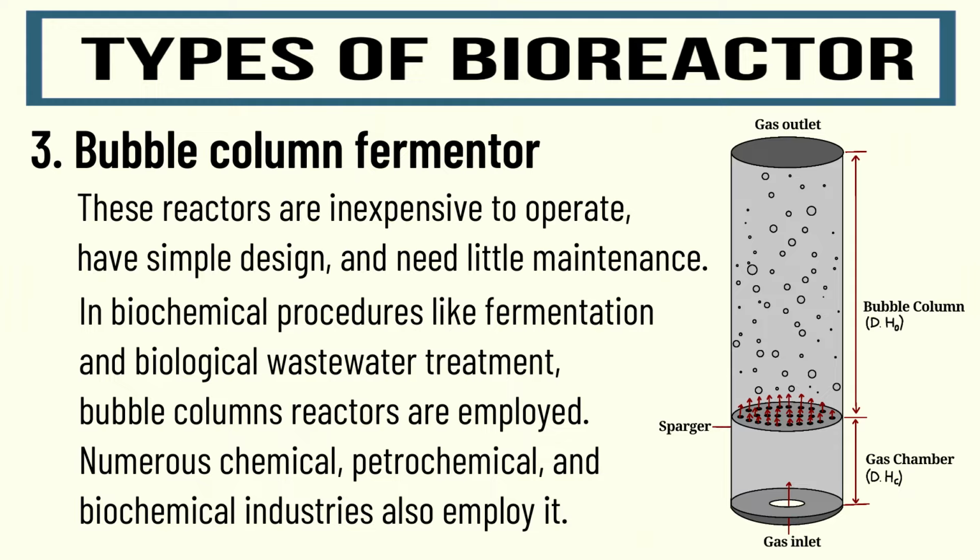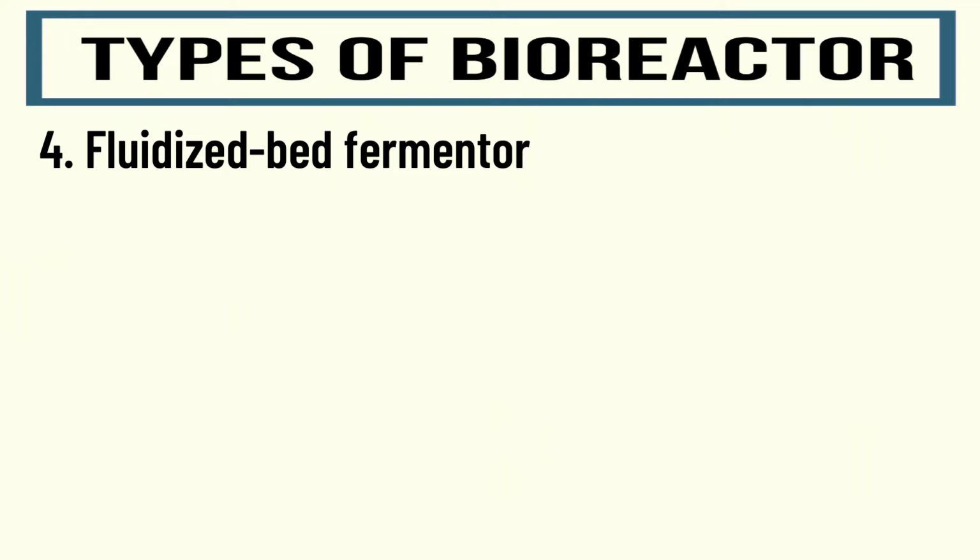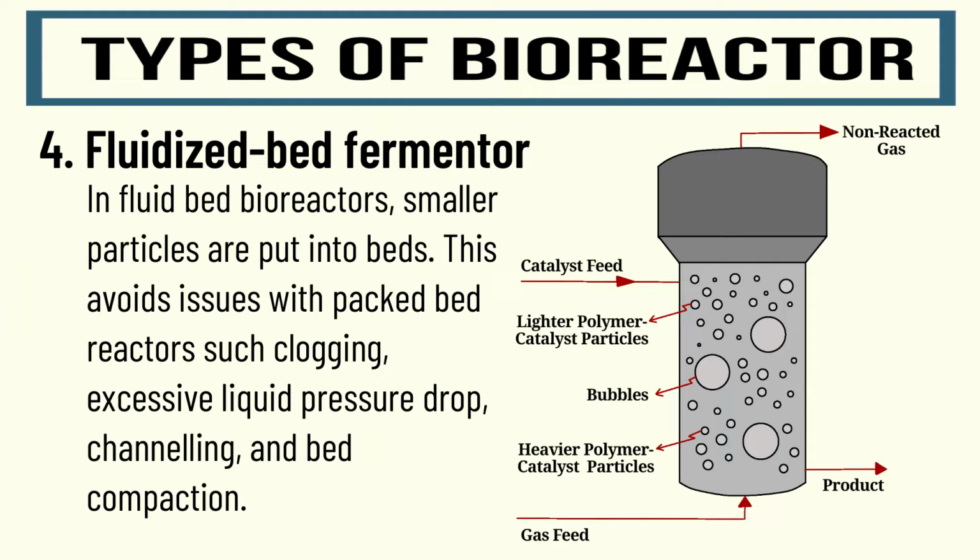Numerous chemical, petrochemical, and biochemical industries are also employing it. Number 4. Fluidized bed fermenter. As you can see in this diagram, in fluid bed bioreactors, smaller particles are put into beds. This avoids issues with packed bed reactors such as clogging, excessive liquid pressure drop, channeling, and bed compaction.